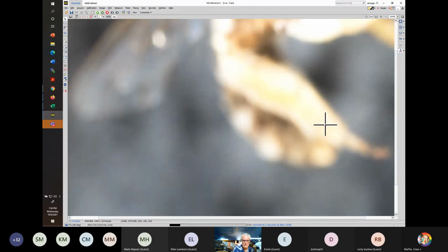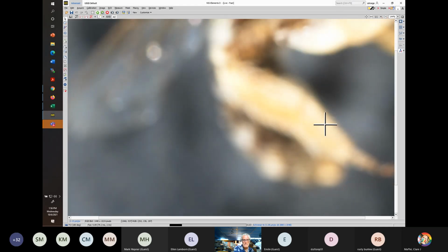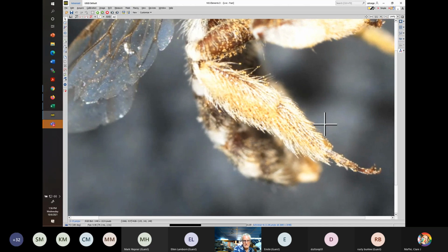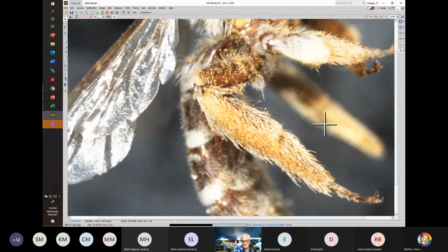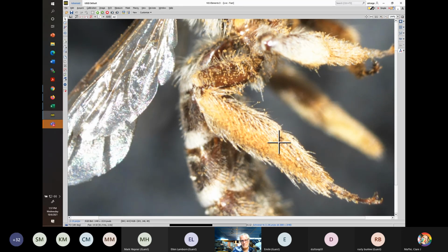In Macropis, even though there was a lot of hair there, the basotarsus is about the same width as the tibia. Okay, so tibia, basotarsal segment, not quite as long as the tibia as was in the male, and the width is less than the tibial width.